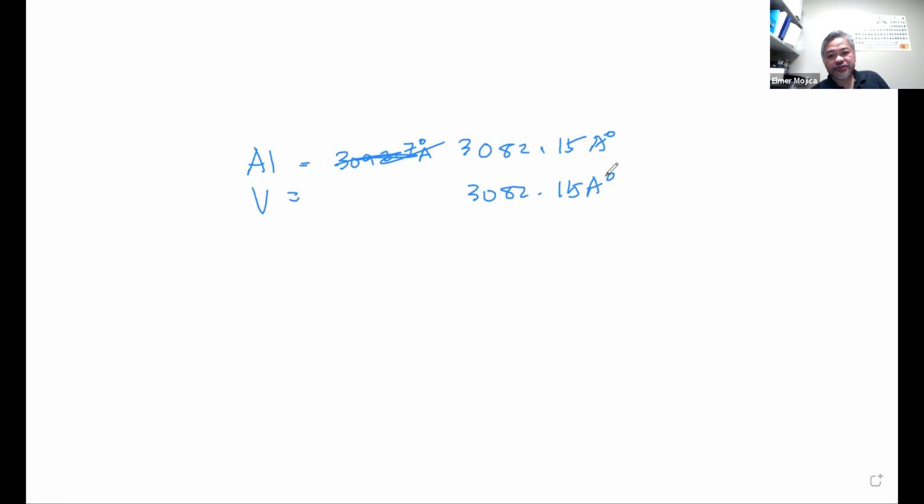So the way that you're going to solve this is to use another wavelength for aluminum. When you use this wavelength to analyze your aluminum, any interference from vanadium is eliminated. Okay? So that's what we call the spectral interferences.